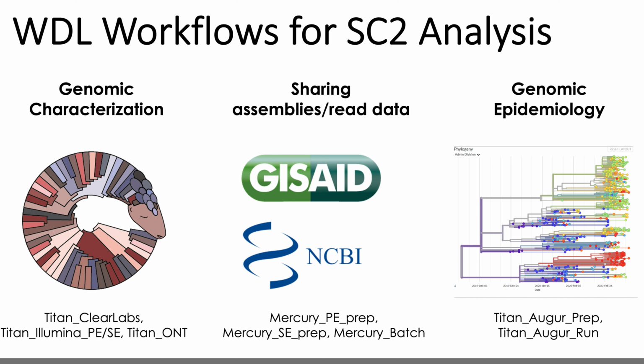All right, so that is it for this introductory overview of our WDL workflows for SARS-CoV-2 genomic analysis.